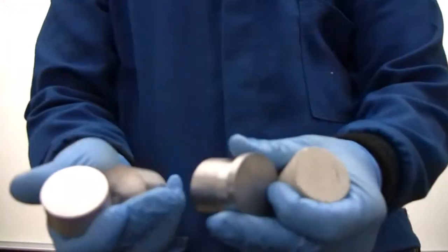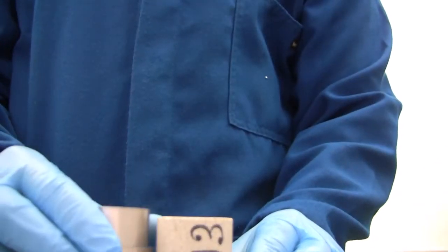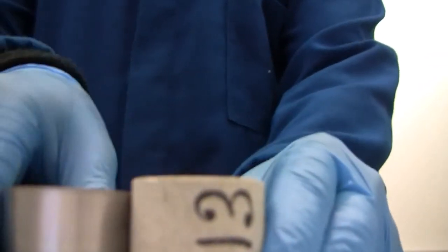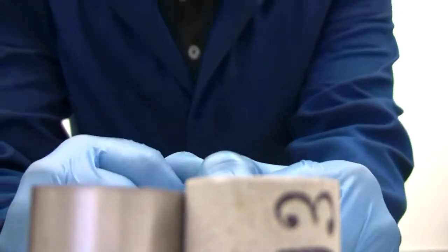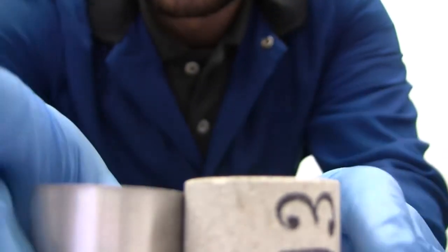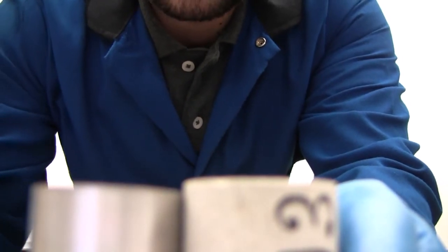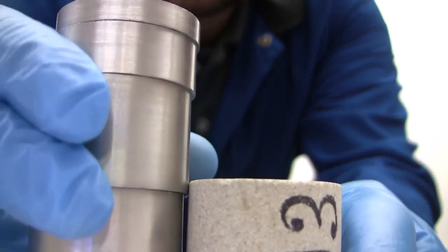Let's say these are my pellets and this is my core. So I put them on a bench beside each other, and I keep adding pellets until their size is almost the same as the core, like this one. I'm not sure if it's clear or not, but there is a small clearance between them, but that's okay. So in this case, if I had all of these pellets inside my chamber, then we remove the ones that have the same volume as my core, and I keep the rest in the chamber. So these ones go in.